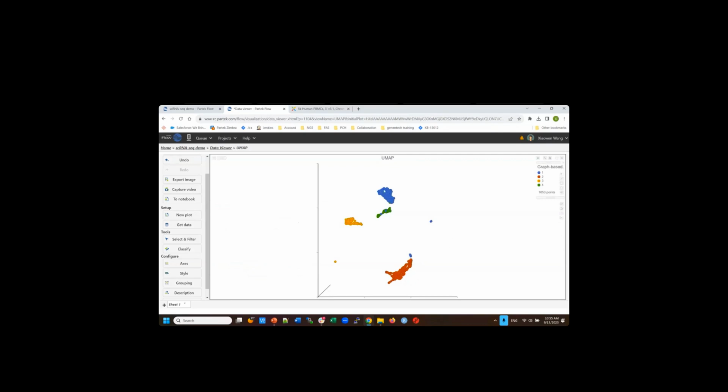So now let's take a look at this. Visually, I can see this red, graph-based is saying this is one cluster. That's pretty good. But some of them are not consistent. Like cluster 1, I think is only over here, but actually graph-based is saying this dot is similar to over here.